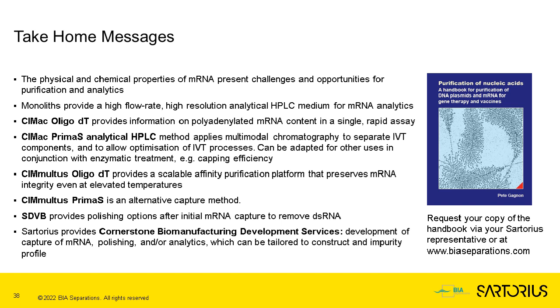Fantastic, thank you very much. And the next question that's come in, so what is the size range of RNAs that can be applied?